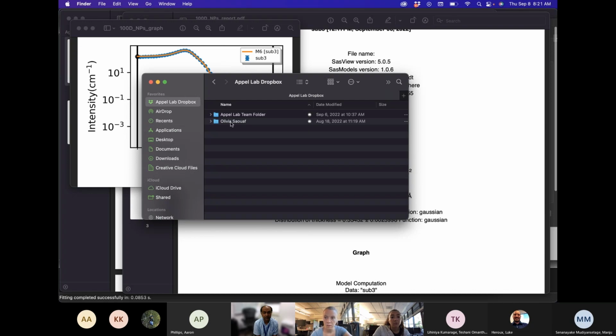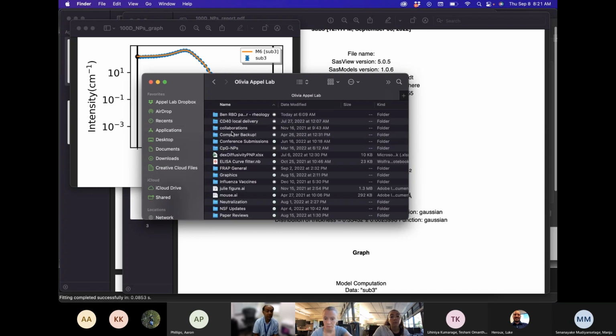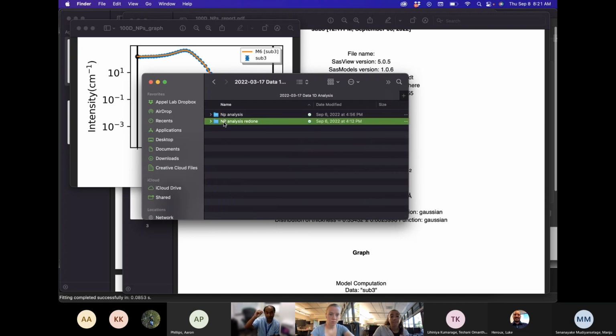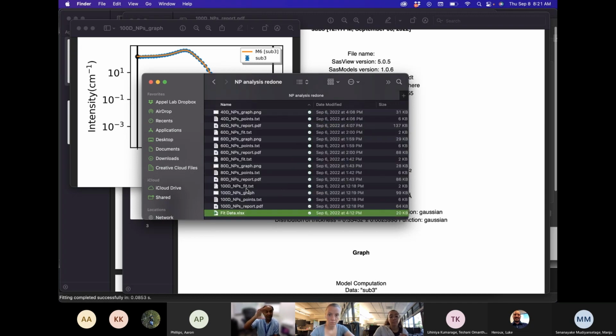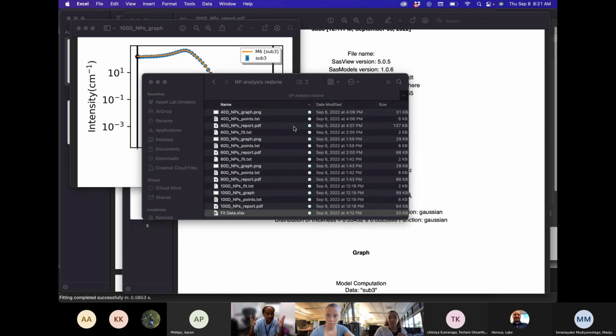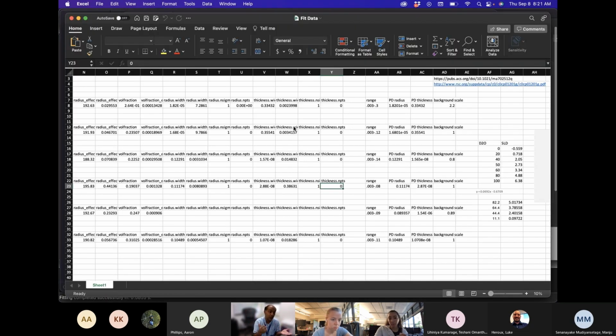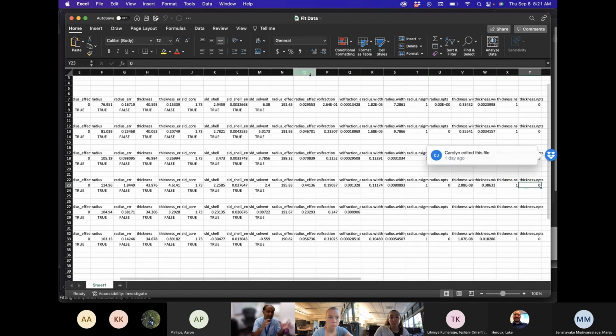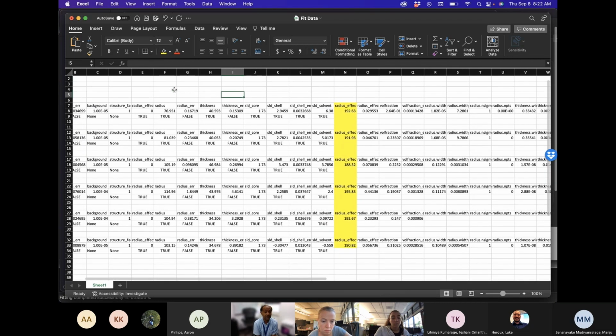So one way is to tabulate how your fitting parameters varied when you changed from one condition to the other. And if they make sense, that's one way to say, I'm not really doing a simultaneous fit, but using the science to say it makes sense. The other way is, if some things could have been constant, you could simultaneously fit them by making them a single parameter.